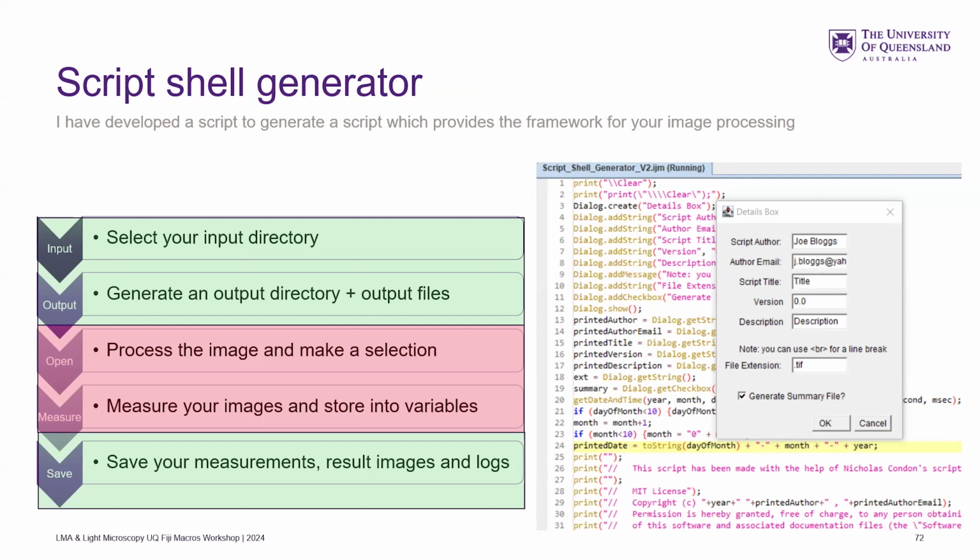So, and I've given this to everyone now. The logic here is, if you run the script, it's really just a whole bunch of print statements, right? But it pops up a little dialogue, and I can't remember if we covered them or not. I think they're later on. But we ask, well, what's your name? What's your email? Because usually, if you give someone a script, you probably want some kind of credit for it. You're probably not going to get authorship, but it should be there.